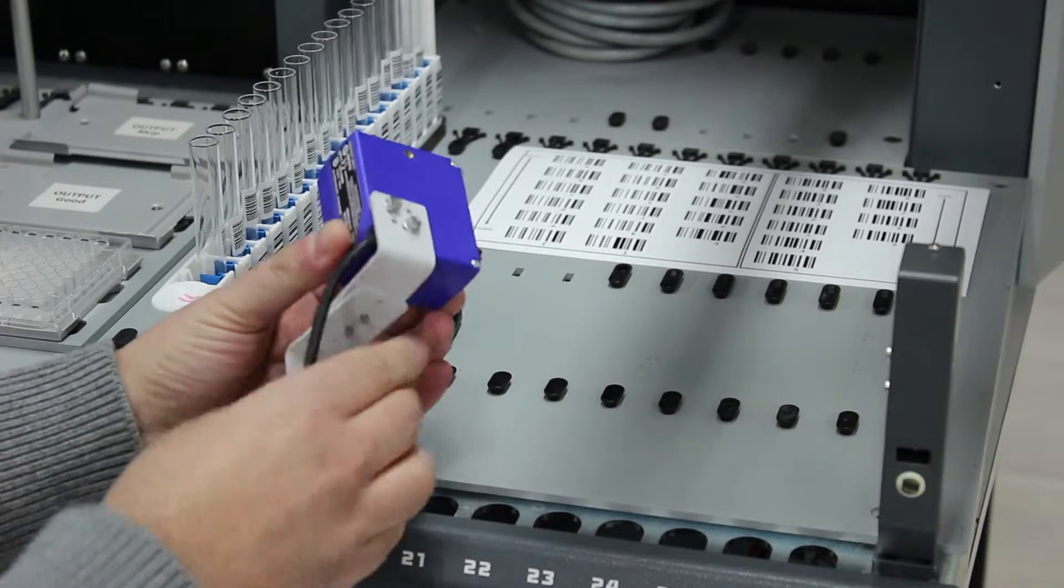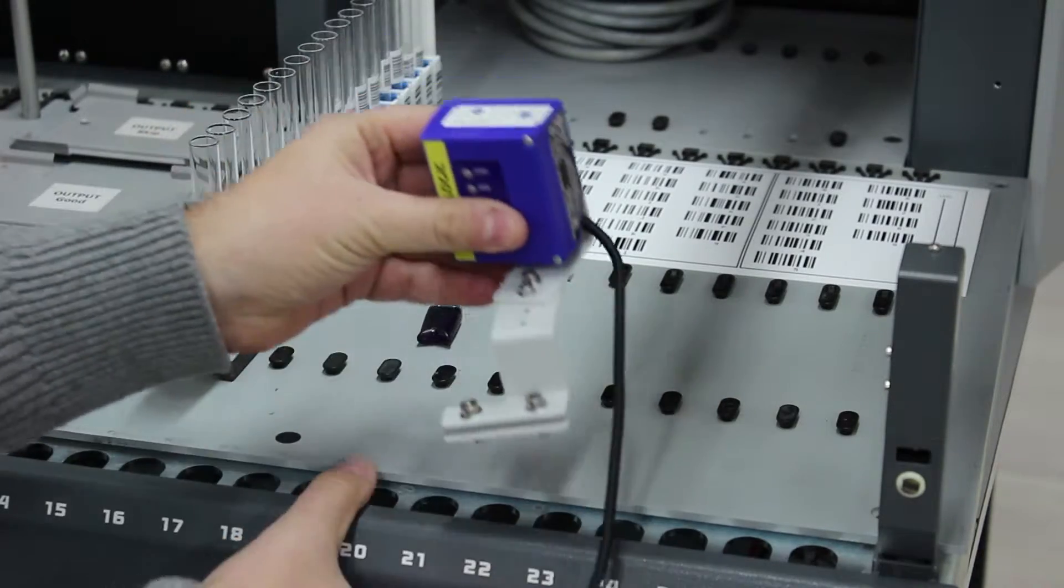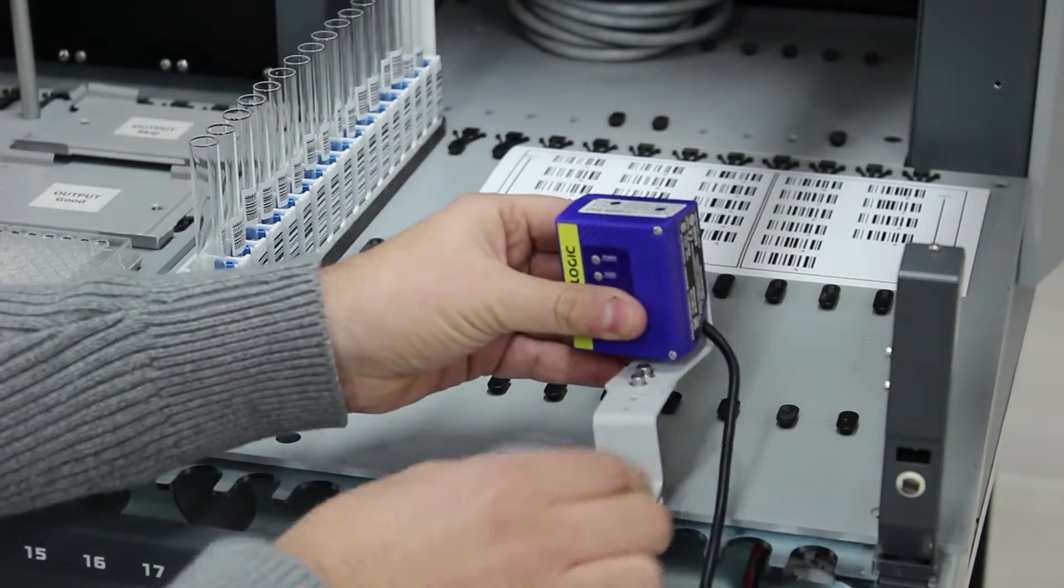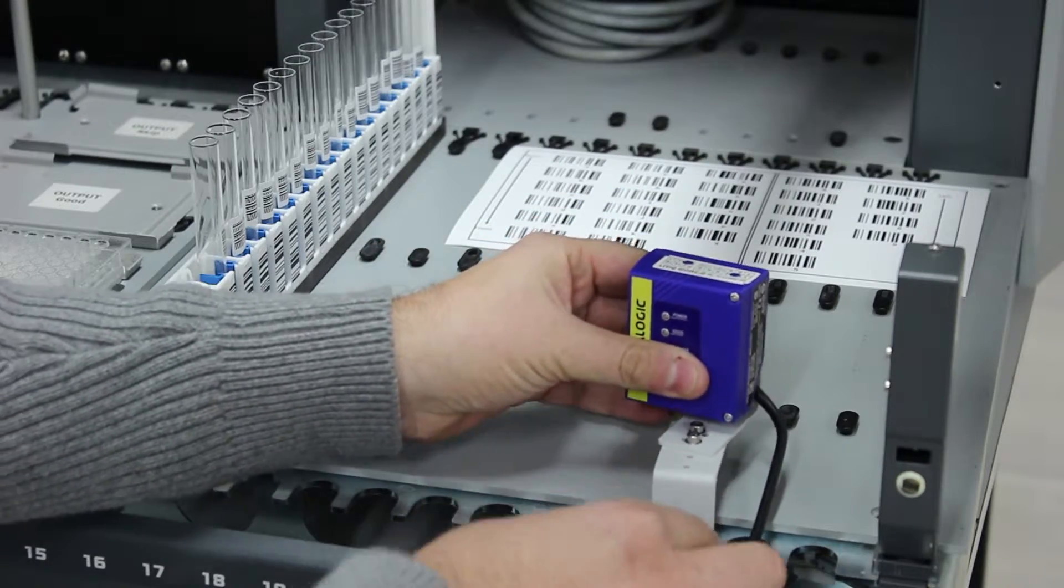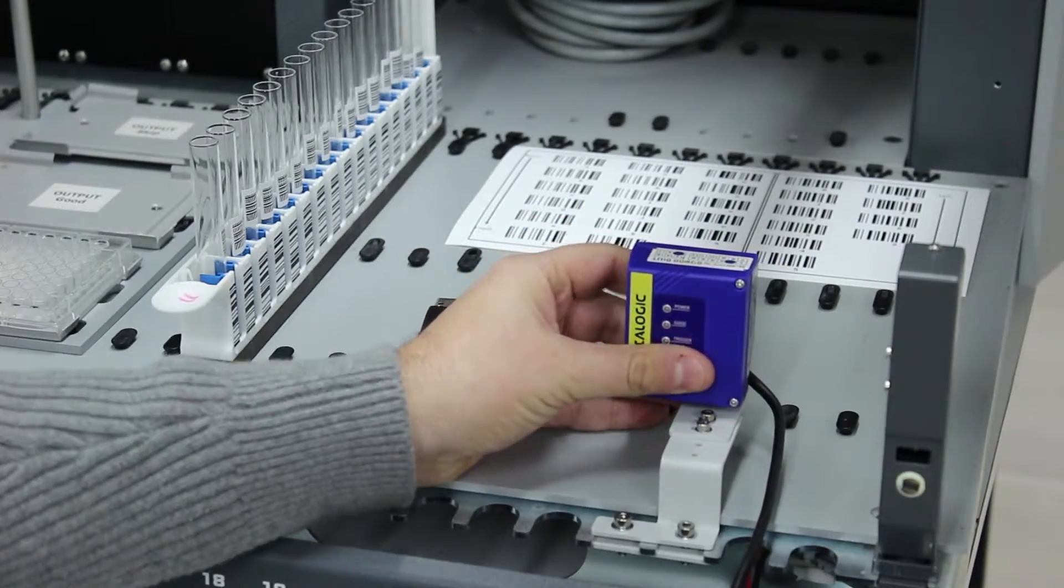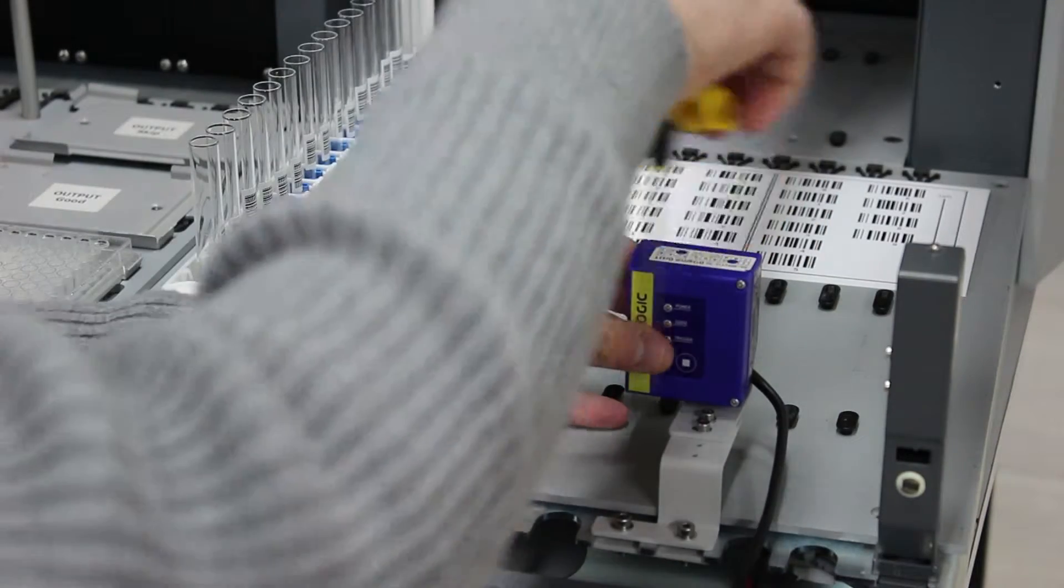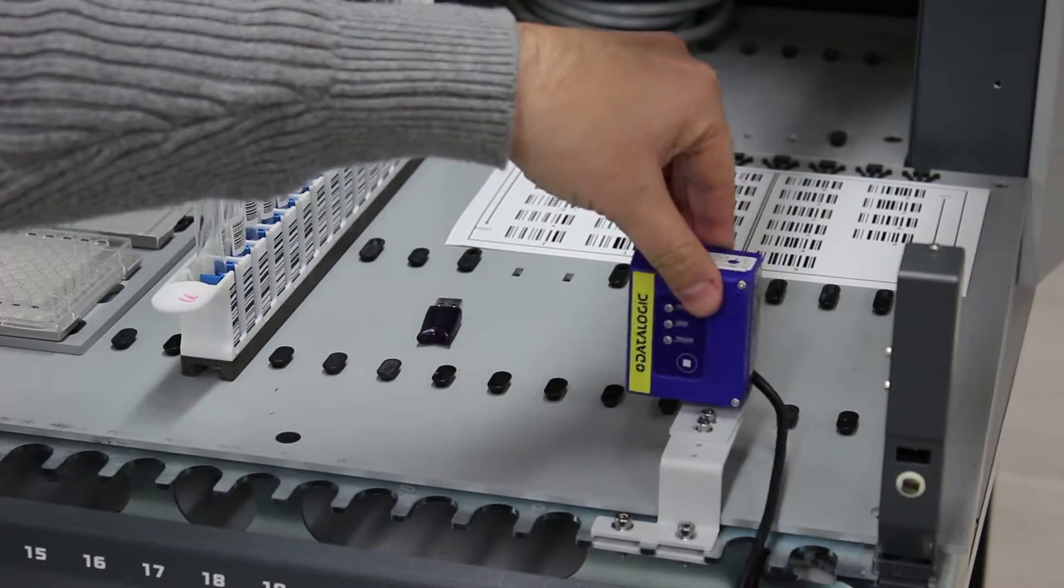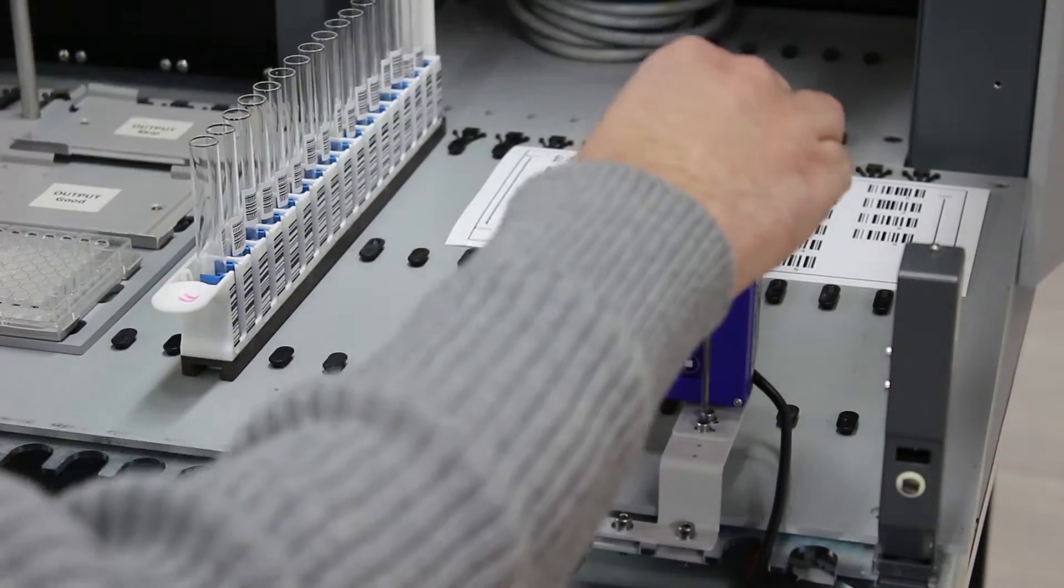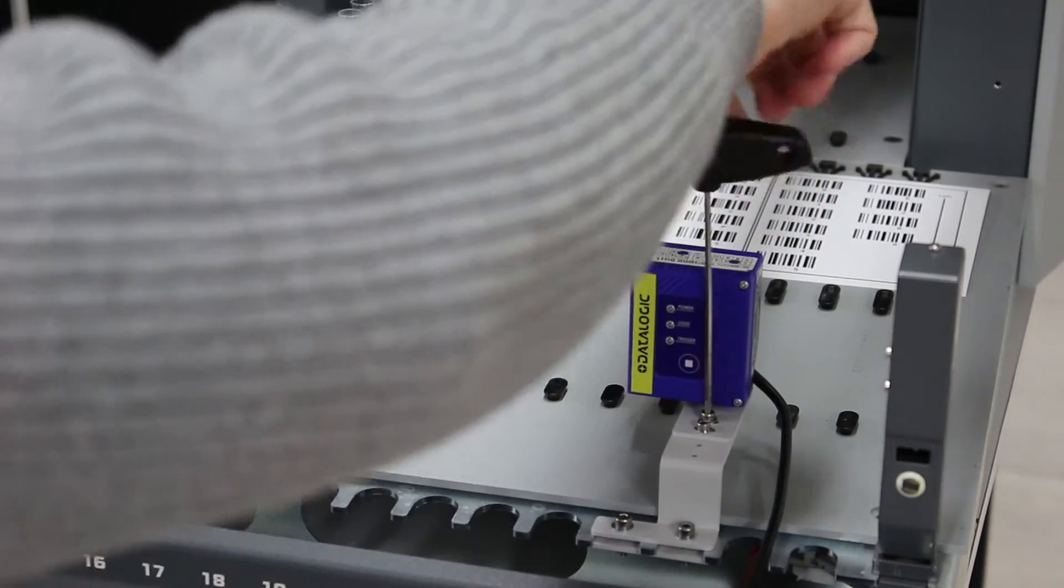To set up the TubeID, first connect the barcode reader to the adapter using the included screws. Then attach the adapter to the EVO work table and tighten the included screws. Adjust the barcode reader angle and fix the angle by tightening the screws.